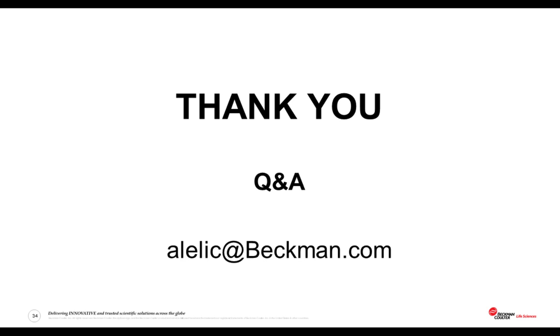So let's get started. Our first question coming in, Dr. Lelic, is if you do not have access to an internal control cell, is it appropriate to use beads?